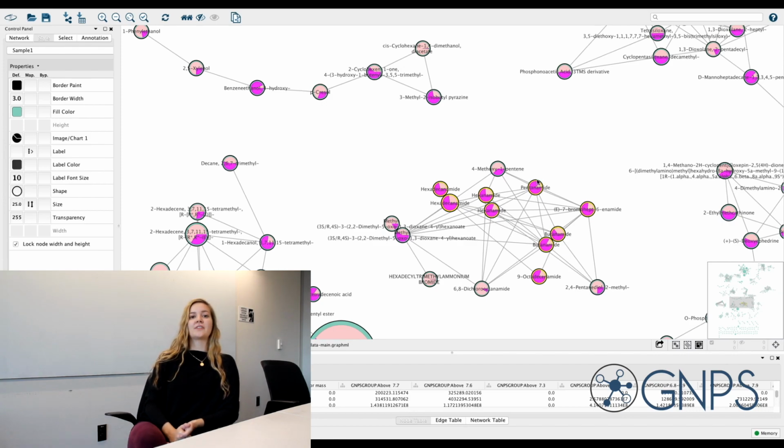Despite decades of biochemical research into the production of volatiles in cheese, there are still areas to explore. This is particularly evident in this one cluster of primary fatty amides, which all show a very similar pattern of dominance at the rind. While butanamide has been mentioned in cheese literature as having a sort of nutty flavor, the synthesis of this group of molecules by microorganisms has not been explored, much less their role in biology or in cheeses.